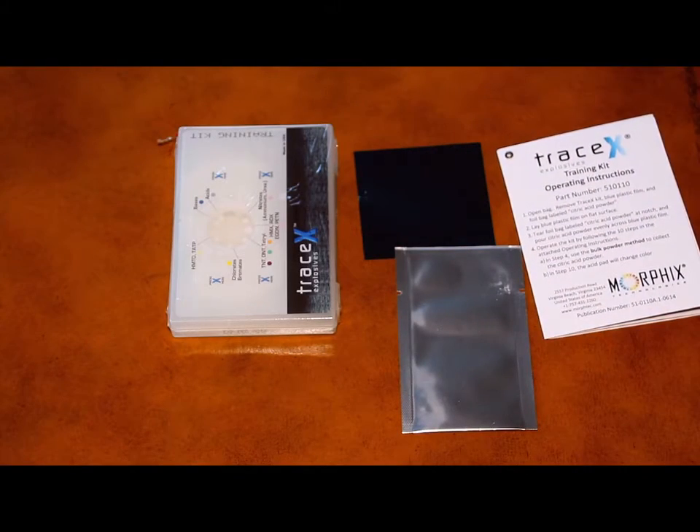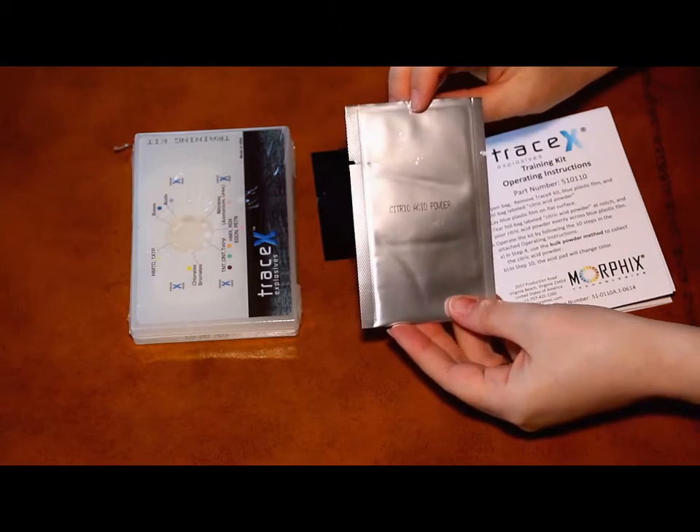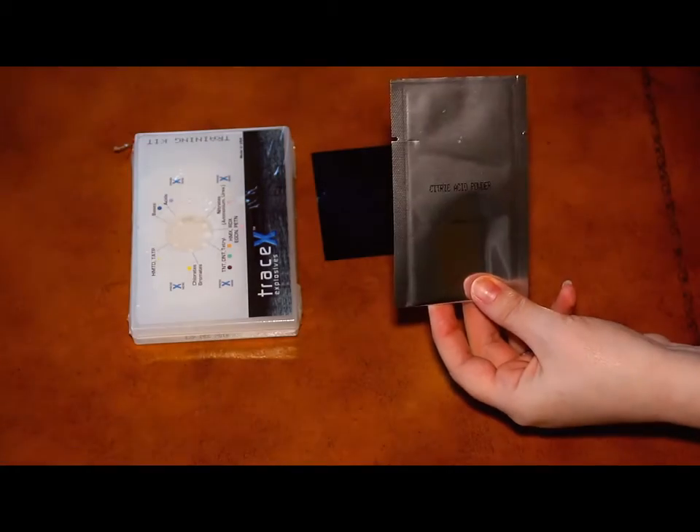This non-toxic and perfectly safe citric acid will be used to simulate an HME, and by testing it, we will be able to see how our kit works.